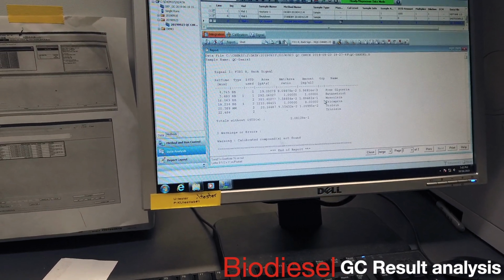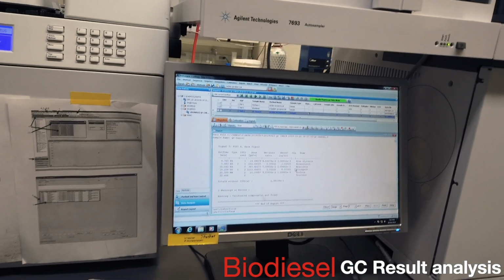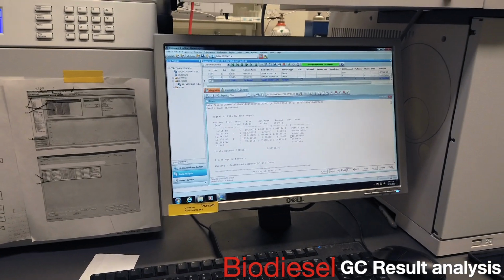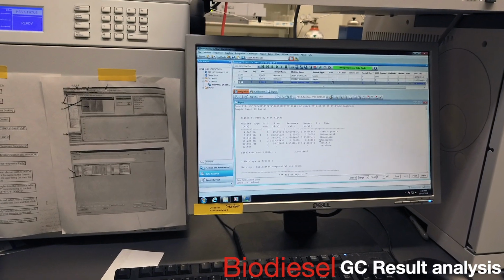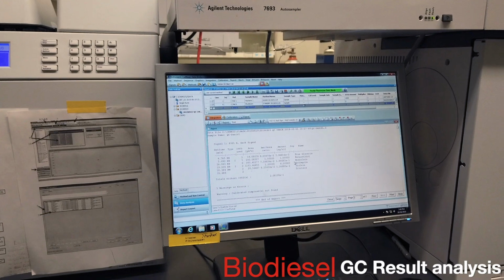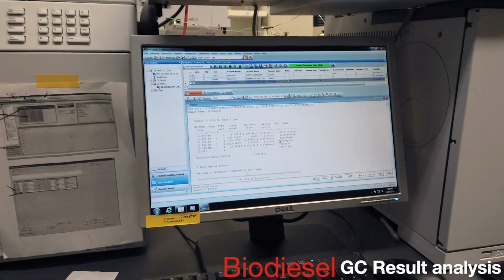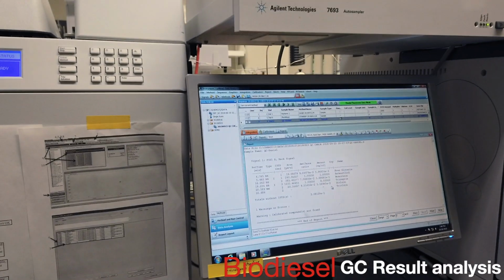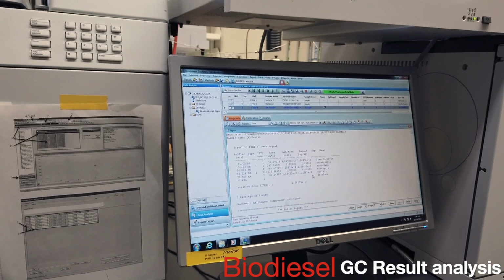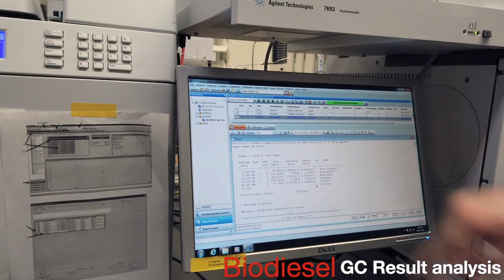All right. Great job. So what we put in the method won't matter, because what we put in the sample, 1,000, 8,000, whatever, it's fine. It'll still use the multiplier from what's in the method, and then you still put the sample in milligrams. Yeah. Now you leave it as milligrams. Correct. So all of this stuff you don't need to do. What we did just before this, you will need to do, to analyze the results, yes. But now it should just spit out what you need.